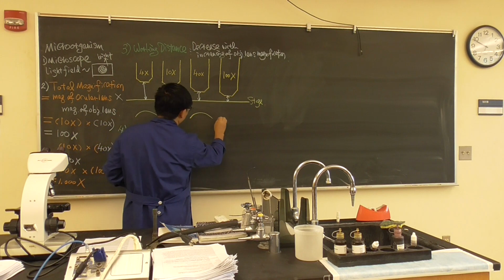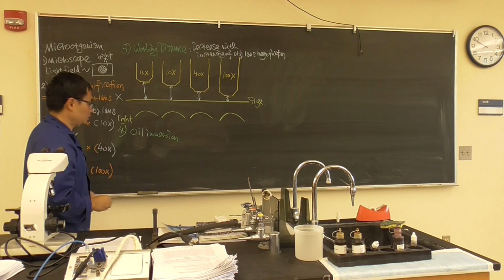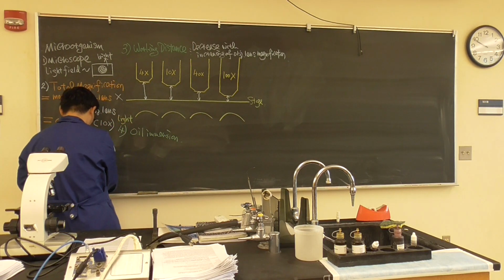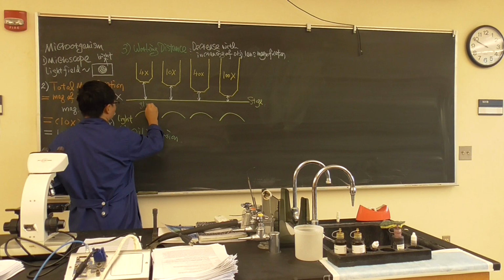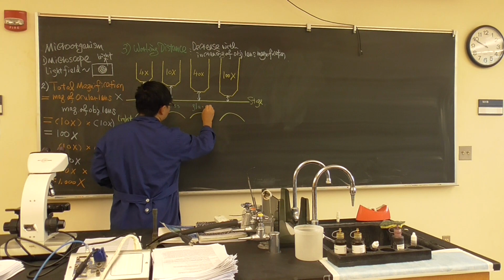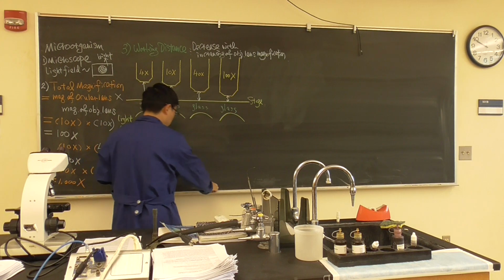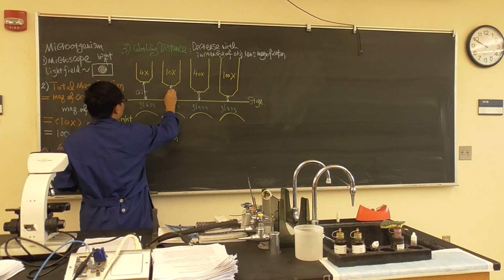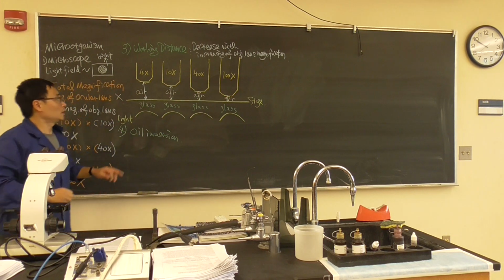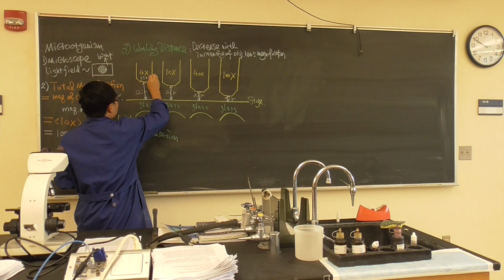Okay, the light is right here. That's a light source. Now this area is glass. So we're gonna say this area is glass. Okay, the whole area is glass. This area is air. Is that right? So that's air. That's air. How about the objective lens? Of course, it's glass. So that's glass again.